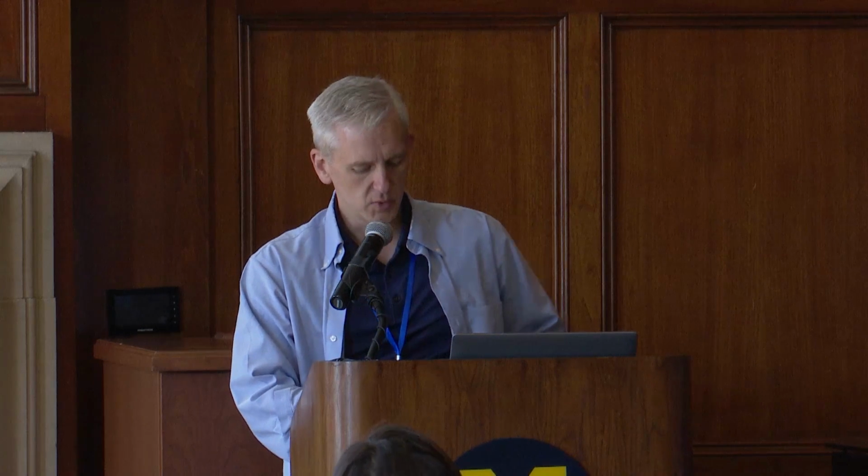Max Lindell is a research scientist at the Medical University of Vienna. Started using Dragonfly lightly in 2020 and then routinely in 2021. Max is part of a collaboration I work with, researchers spanning a few different institutes. They look at a really interesting biological system. And Max is going to tell us about his experience using deep learning. He's going to talk about segmentation and analysis of cellular ultrastructure of retinal pigment epithelium.